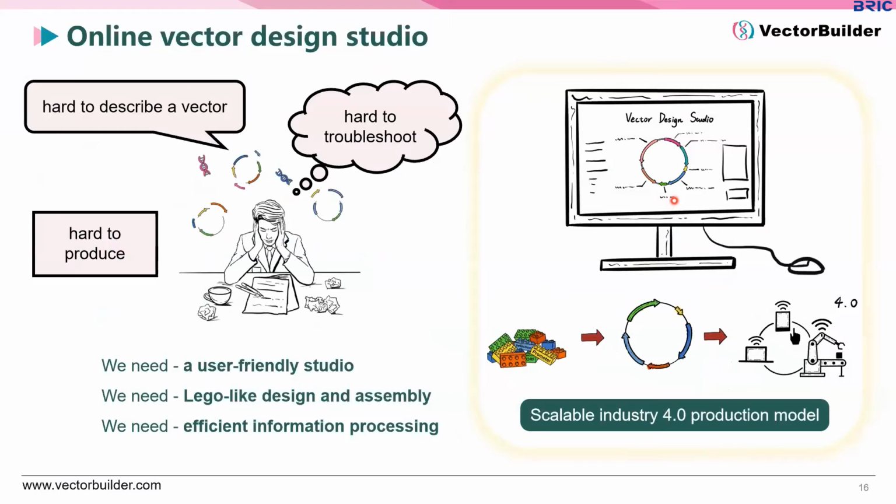A lot of researchers should have experienced this dilemma in the lab: when they are designing a vector, it's very hard to describe. Often you have to draw something out, and when there are issues, it's hard to troubleshoot. It also takes extensive labor and time to produce this vector, no matter whether it's plasmid vectors or viral vectors.